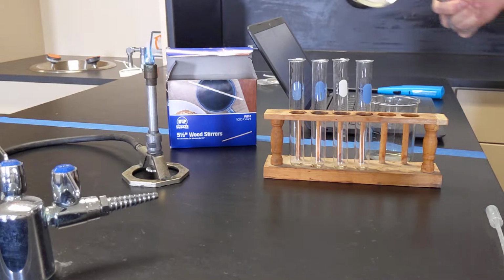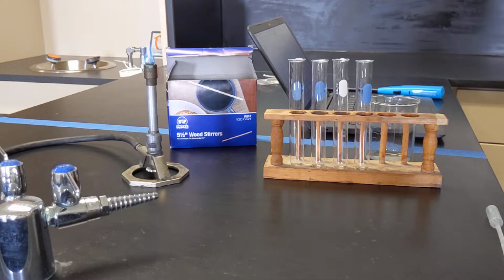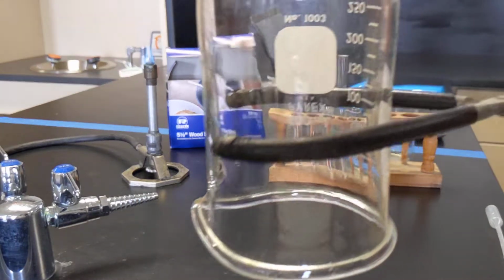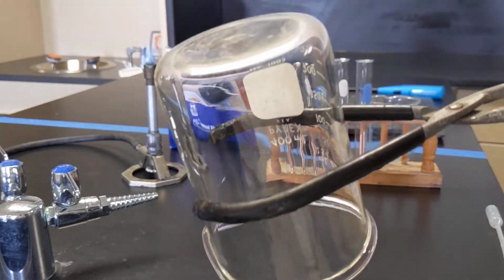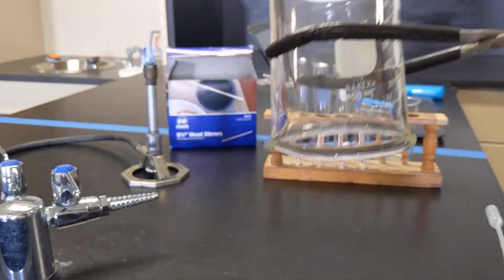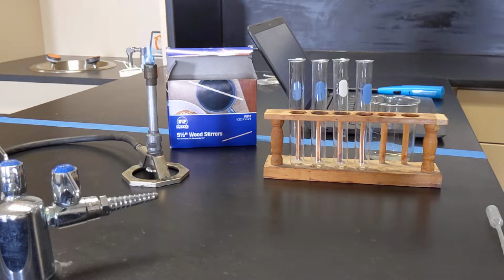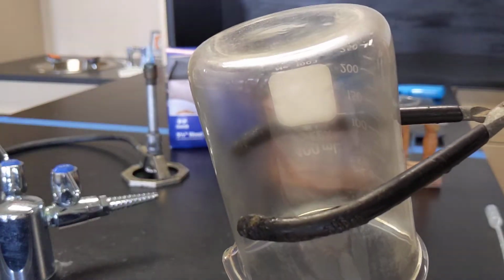So I will put this beaker over it. These are beaker tongs. They have the rubber coating on the end to stop the beaker from slipping through. They add a little bit of friction. I'm going to put that over the flame and then bring it close to the camera here, and hopefully you'll see what you're supposed to see. I know that with the video it's not maybe going to be quite as obvious, but here I go with putting it over the flame. Notice something there. You can see how it's changed.